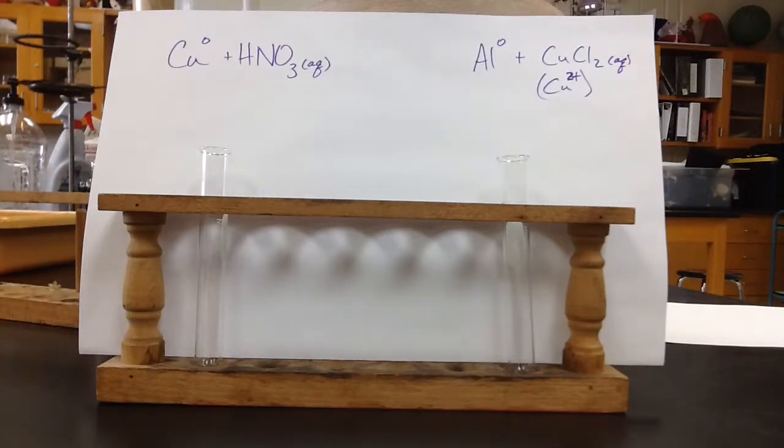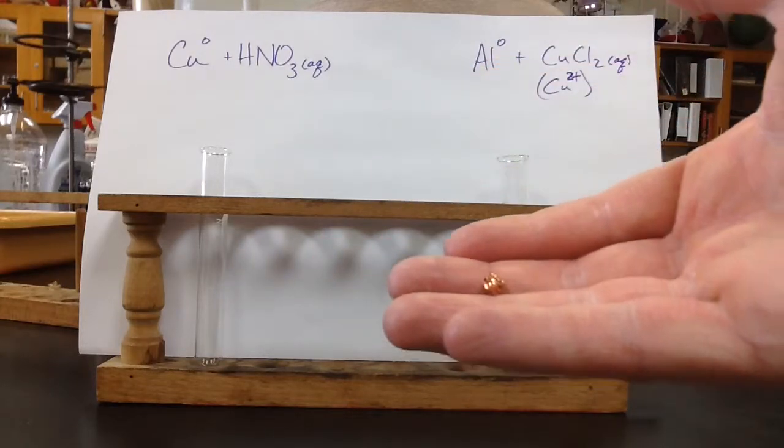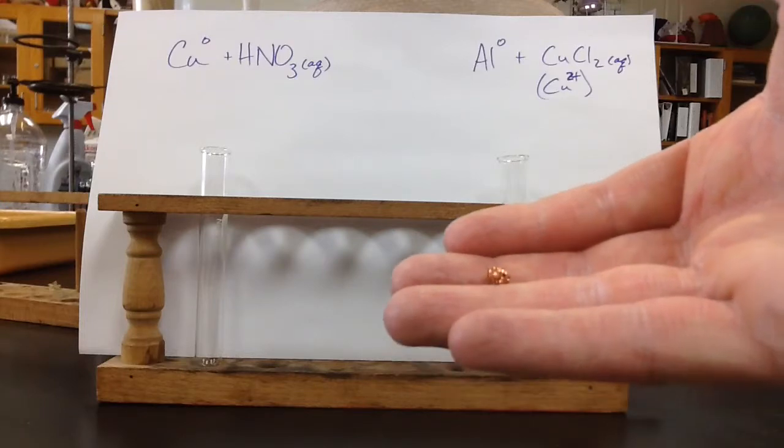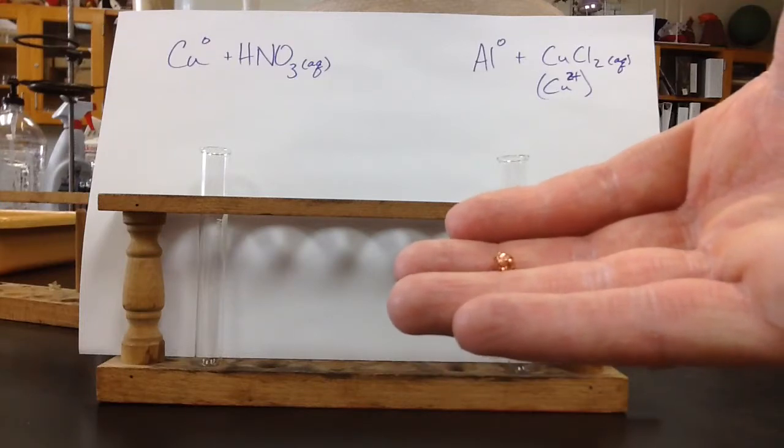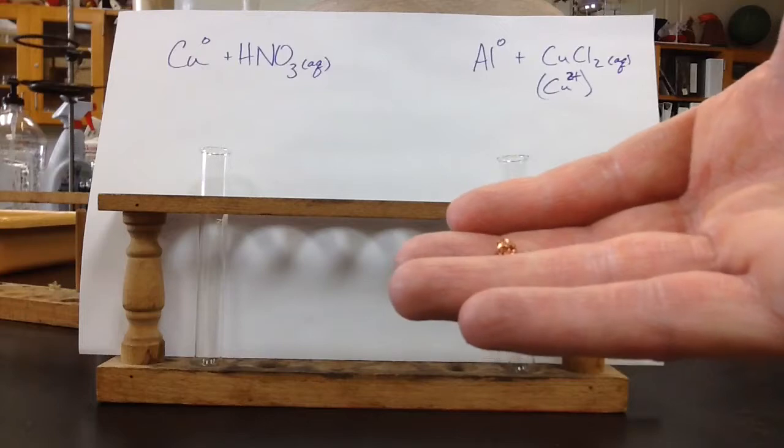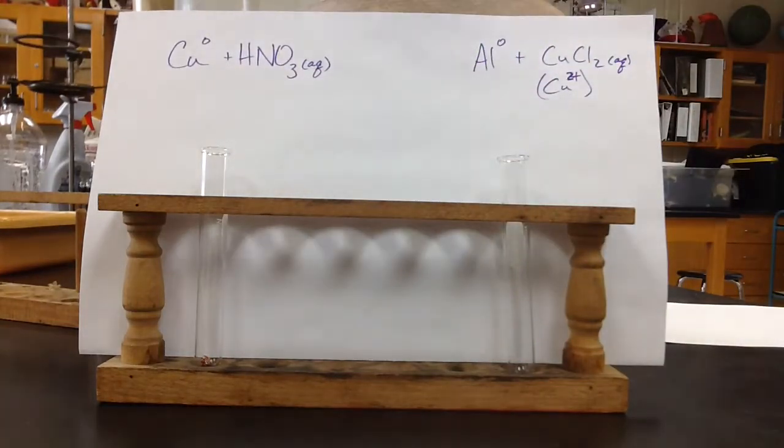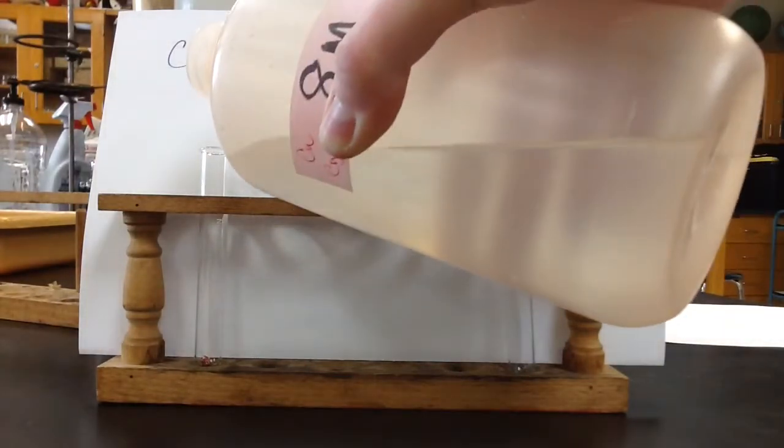So let's start out with the nitric and the copper. You can see on the screen there, we got some copper here, and it's actually a little bit of copper turnings or copper foil that we kind of balled up there. So we're going to go ahead and drop that in our test tube. And then we're going to add some nitric acid. Here's my 8 molar nitric acid that we're going to add.